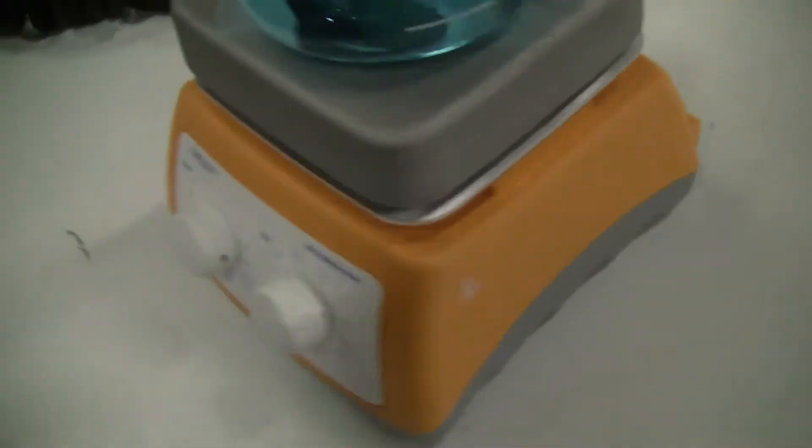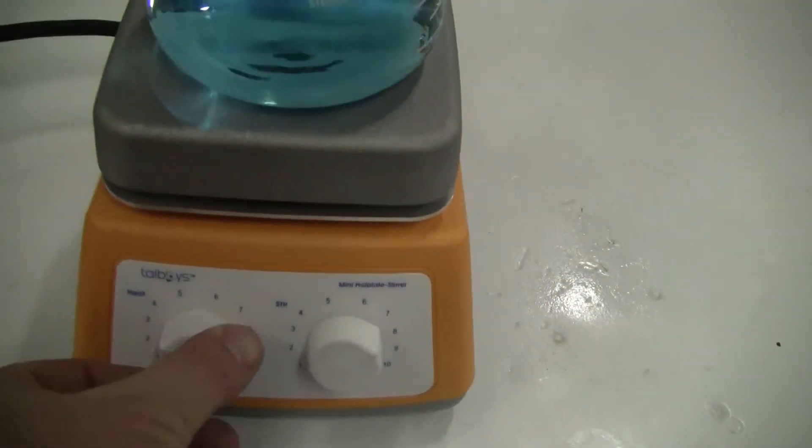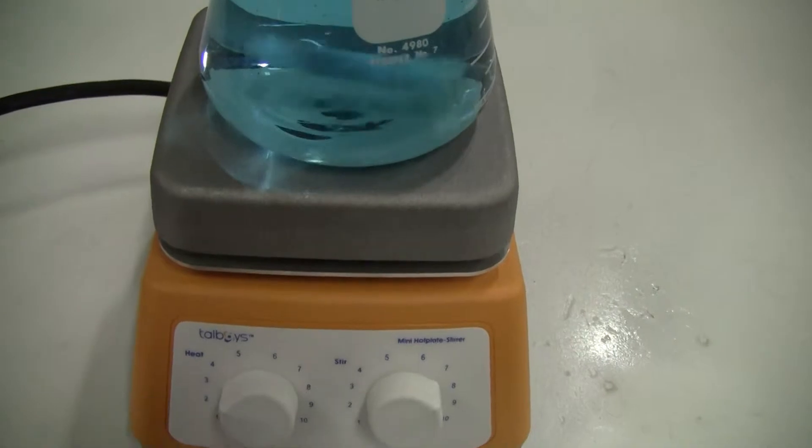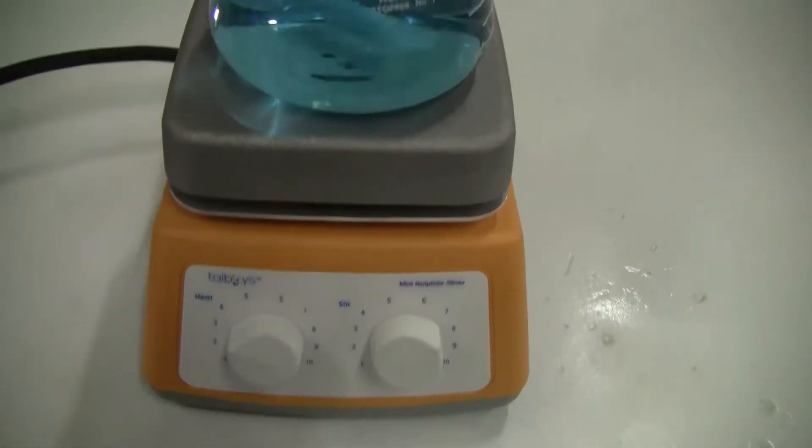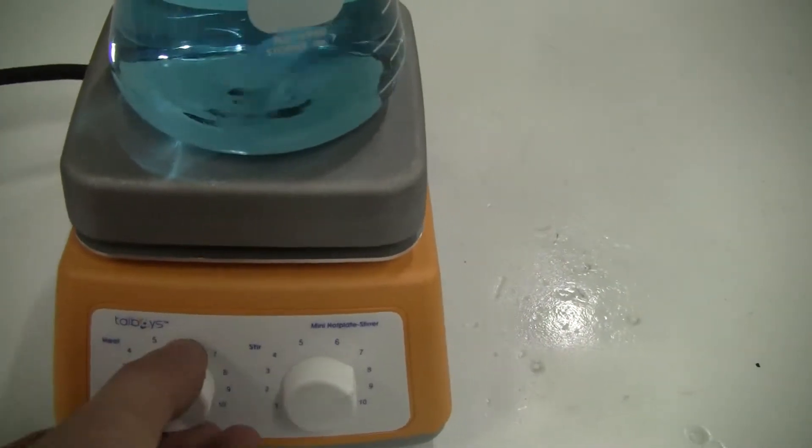This cost-effective hot plate stir is very simple. There's no heat indication. You're just going to set it at a particular percentage or a number. The plate's going to get hot. If you don't want heat, you would turn it off.